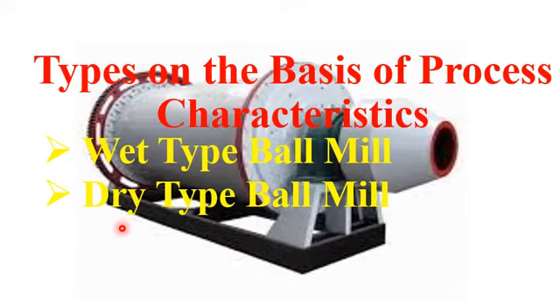Whereas in the case of the dry type ball mill apparatus, the discharged materials are extracted by airflow. So airflow is used in the dry type ball mill apparatus, and there is no wetting medium used. In a drying condition, a bulk material is converted into fine nanopowders or nanomaterial.